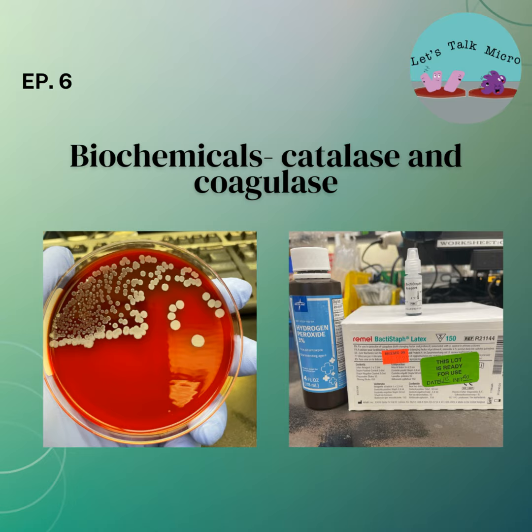So today we discussed two very important biochemicals. You start at the top with catalase. If catalase is positive, you move to coagulase. Then depending on the result, you have Staphylococcus aureus, or CNS, coagulase negative Staphylococcus.